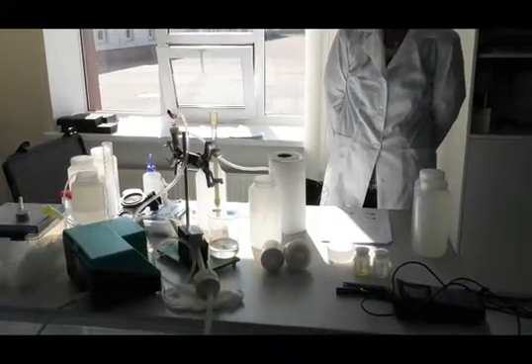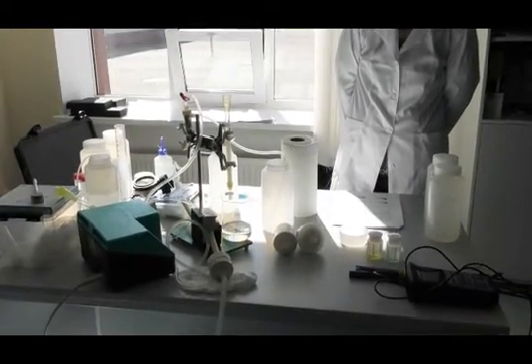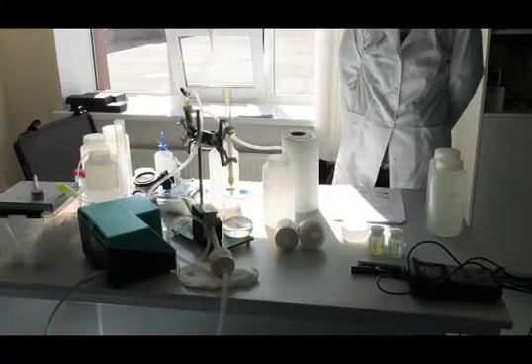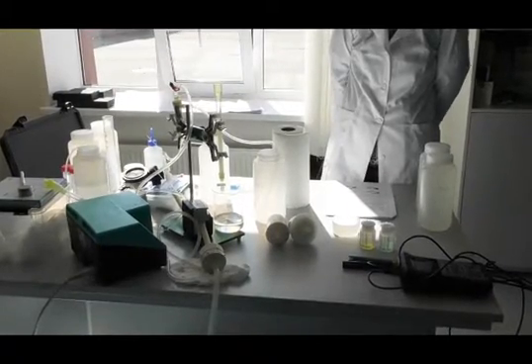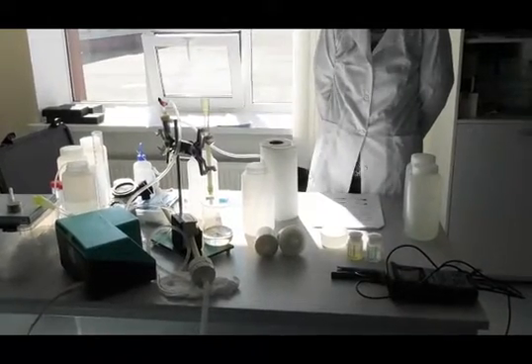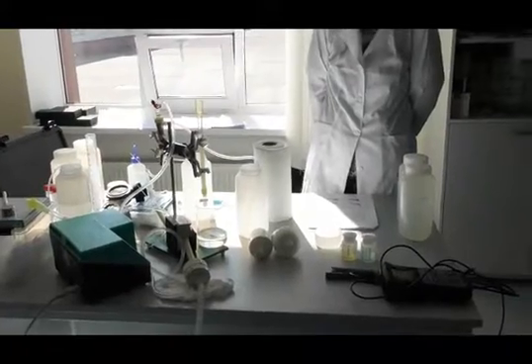So the best is to do it out in the field, in the river, in the lake, and to have as short a time as possible from the sampling to the filtration, and then even to the ion exchange. So we bring the whole system into the field.